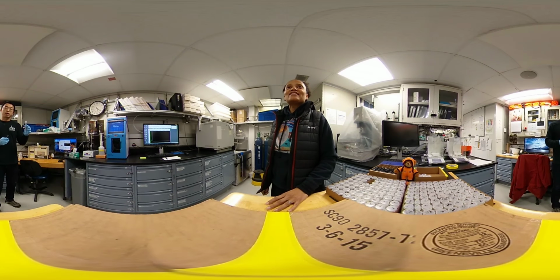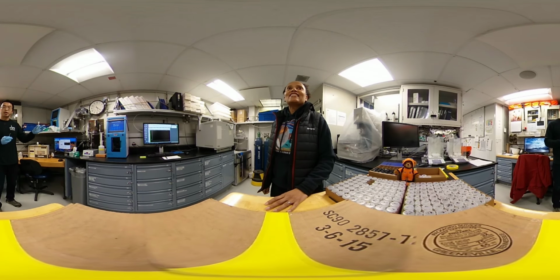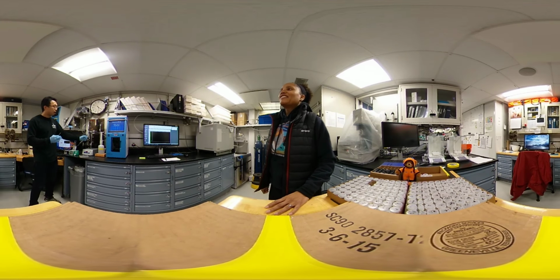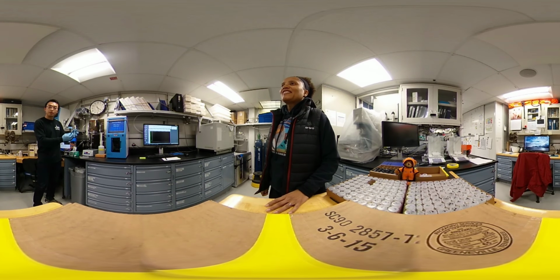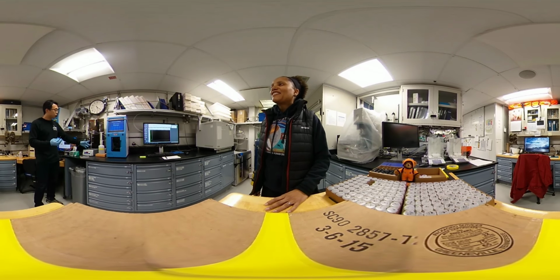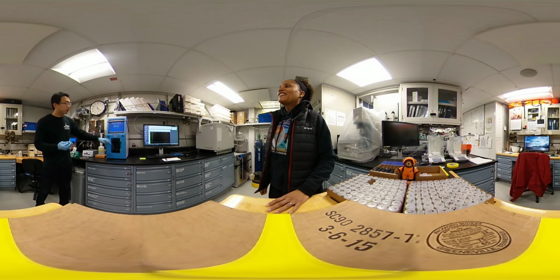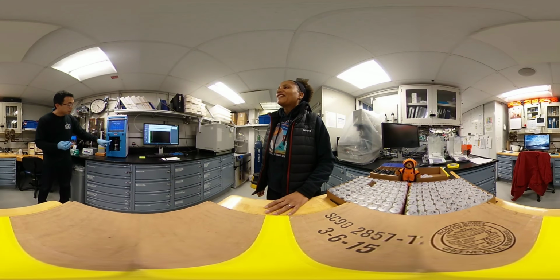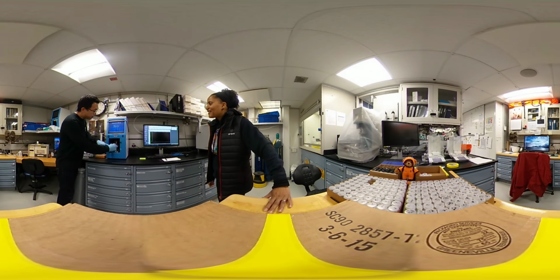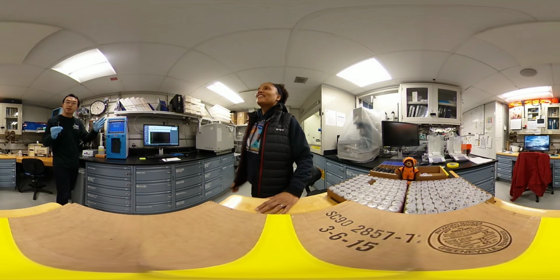And this is for the inorganic geochemistry, where we put the sample in here, dissolve it in HCl, hydrochloric acid, and load it on the coulometer here. We inject the HCl into our samples. As we know, CO2 will be generated, and the CO2 will be brought up all the way here and delivered into this machine called the coulometer. If we open the door here, more CO2 is going to cause more color change in this cell. This machine will read the color differences and calculate how much carbonate we have in our sample.